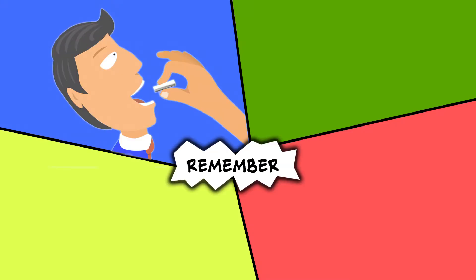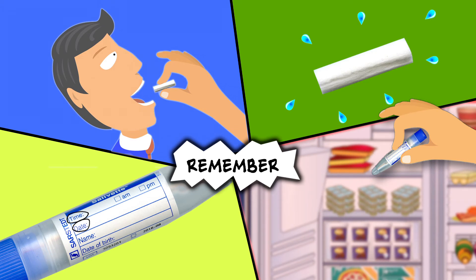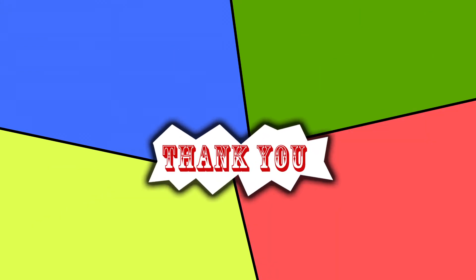Thank you for helping to advance science. Remember, put the sponge in your mouth but don't chew it. Then take it out and give it a squeeze. If it's soggy, great. If it's not that wet, put it back in your mouth for a few seconds. Once it's squishy, put it in the vial — and don't forget to put the date and time on there. Finally, put the sample in the freezer, not the fridge, so it stays nice and cold. Thank you for helping us with our study.